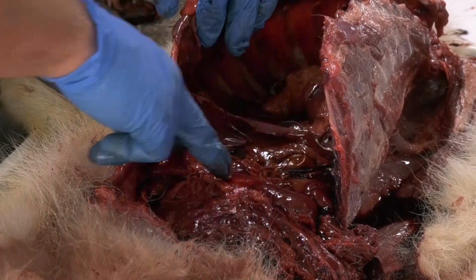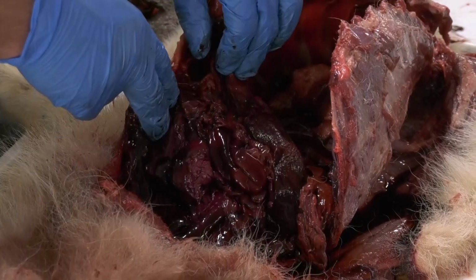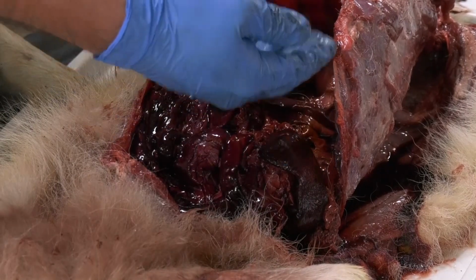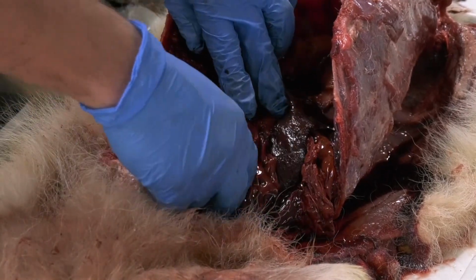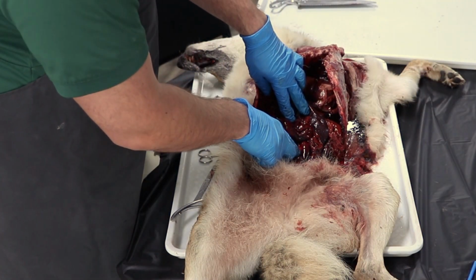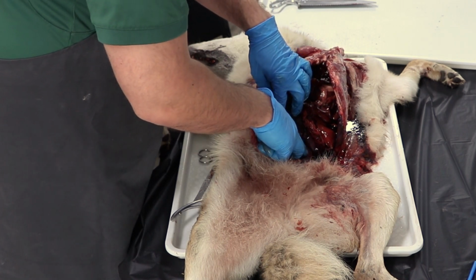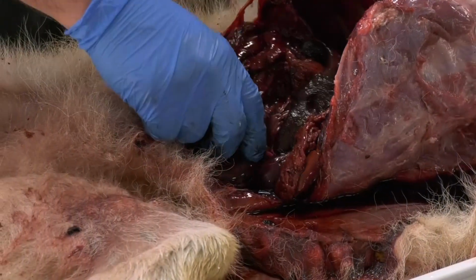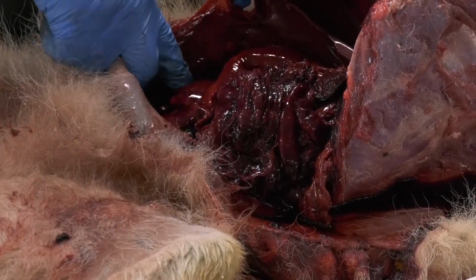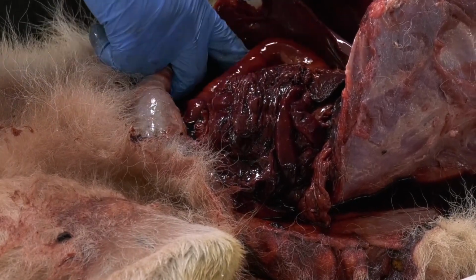All right, so we've got lobes of the liver, large fleshy stomach. We've got a big mass of small intestines that are sitting ventral to a shorter but larger in body large intestine here. Let's see, here is a great big fleshy kidney right here on this side. And I'm gonna bet that if we go to the other side, yep, there's another great big fleshy kidney on the other side. Large intestine here on the animal's right side.